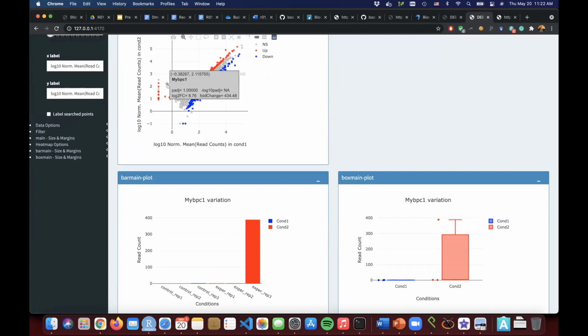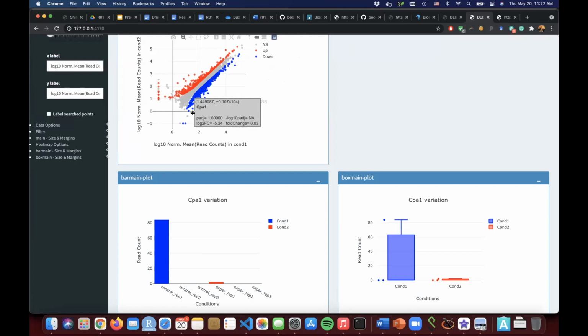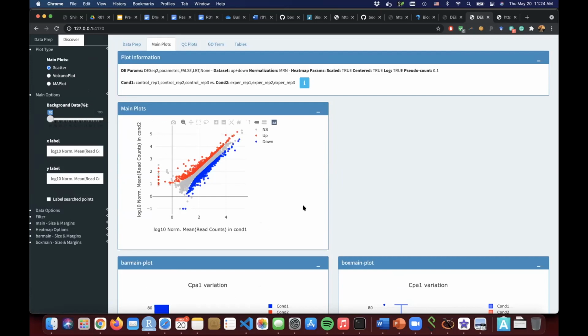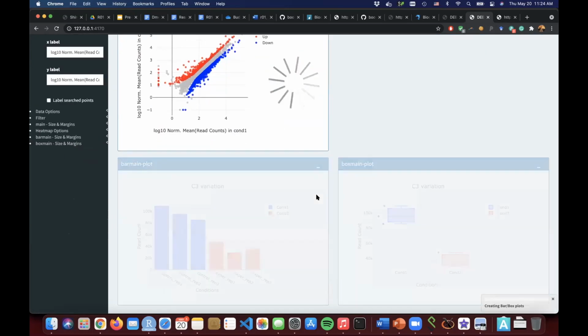See, fold change is huge. By just using fold change, you might make a mistake. So that's why you cannot use fold change. You need to also use the p-adjusted value. That will actually give you a better estimate and also better findings. So in this case, another one here that is not significant is because the count in one condition is 80 for one gene. So this is how you hover over these genes and do this kind of analysis.